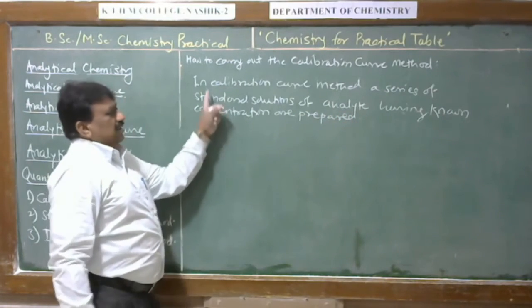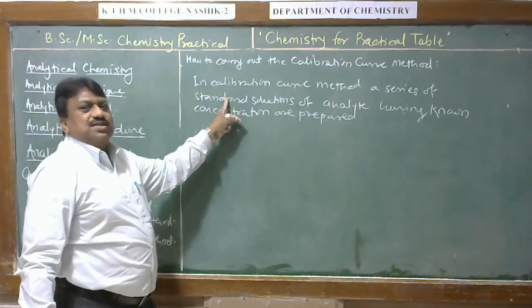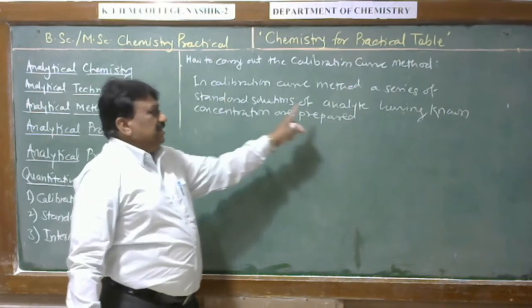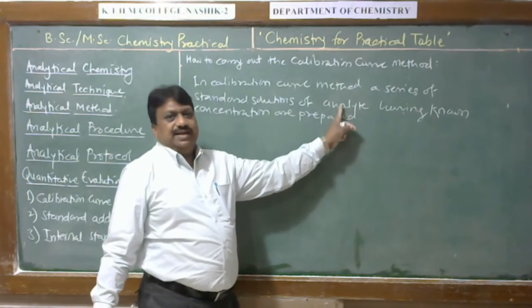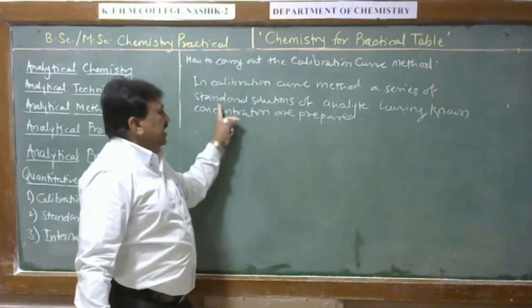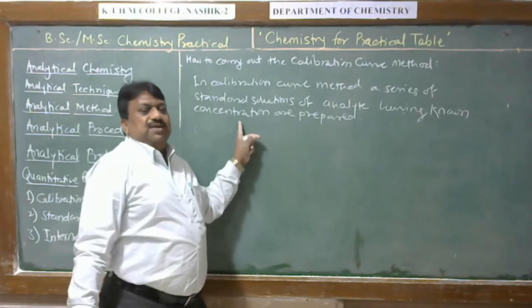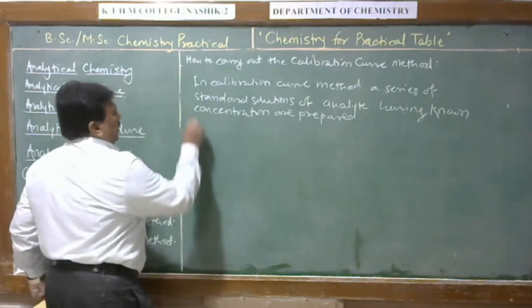That means series of standard solution whose concentration is known, that is prepared. That means standard solution and sample solution should have identical analyte. Therefore, a series of standard solution of the analyte are prepared whose concentration is accurately known.